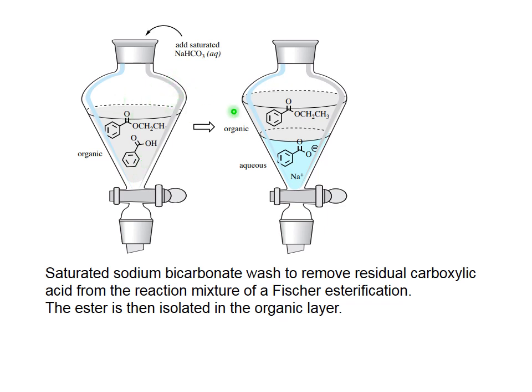As a result, our neutral compounds stay in the organic phase, but our ionizable compounds go into the aqueous phase because they are negative ions now.